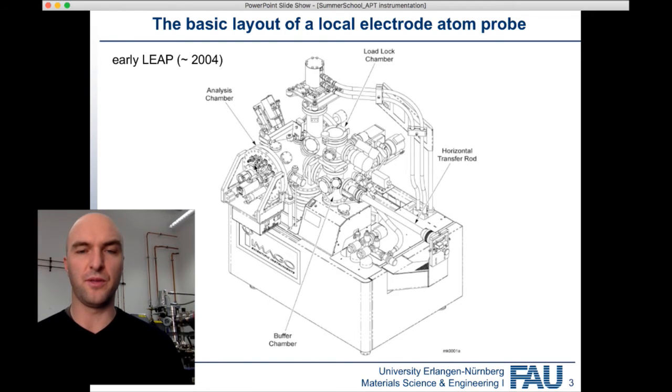On a modern Atom Probe with a laser, you'll have an entire laser unit, and you won't have the viewport glasses because of the laser safety concerns. So this is the basic layout: you've got the load lock chamber, the buffer chamber, and the analysis chamber. On the analysis chamber, you've also got the cryo, which produces the background noise you can hear. This older system also had gas inlets for field ion microscopy, but we've actually built a separate field ion microscope for that.